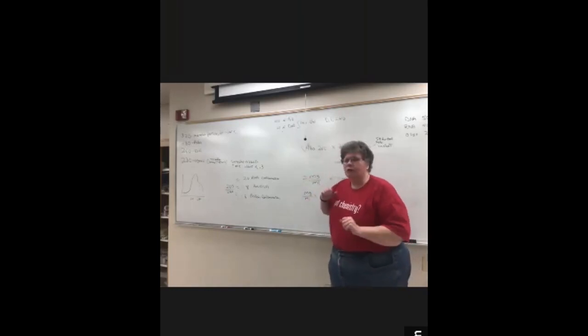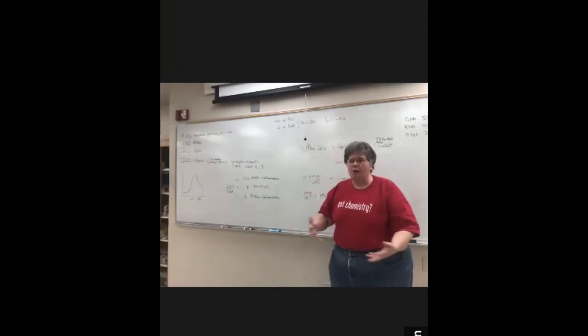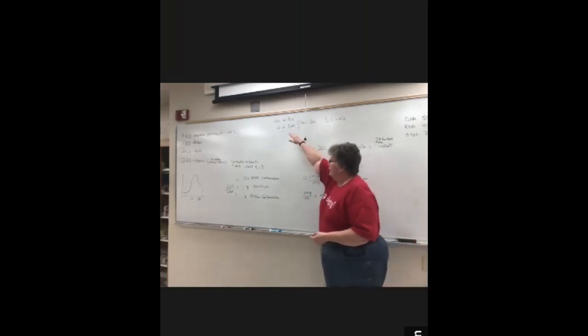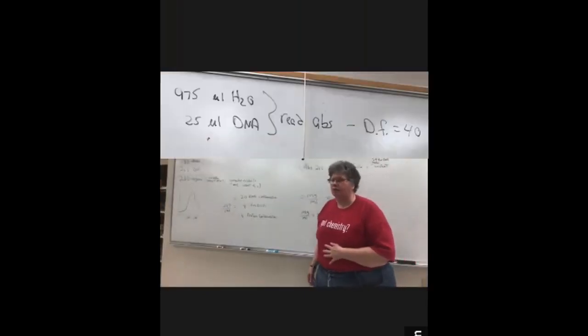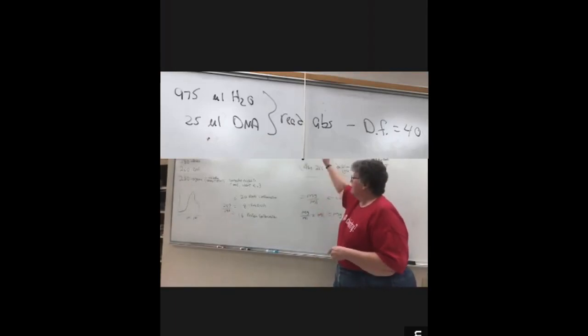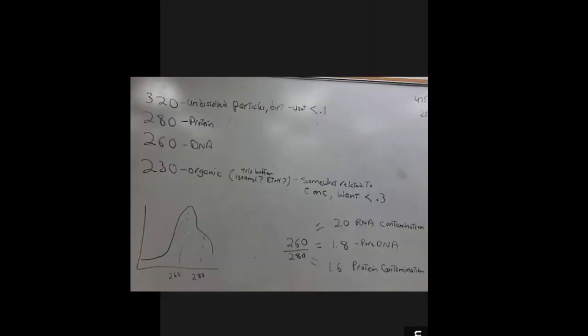So then you're going to do a dilution of your DNA, because if you tried to add it straight into the spectrophotometer, it would overwhelm and it would be out of the absorbance range of the spectrophotometer. So you're going to take 975 microliters of water and 25 microliters of DNA, which is a dilution factor of 40, and you're going to read the absorbance at 4 different wavelengths. You're going to read the absorbance at 320, 280, 260, and 230.